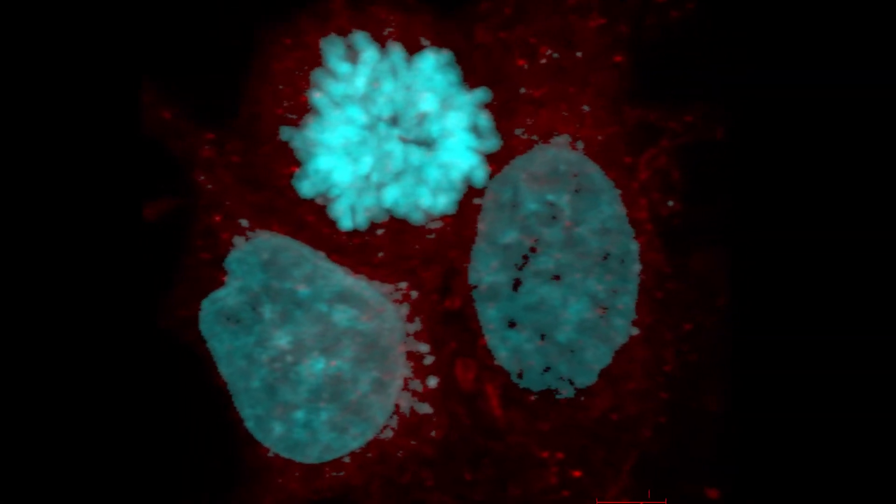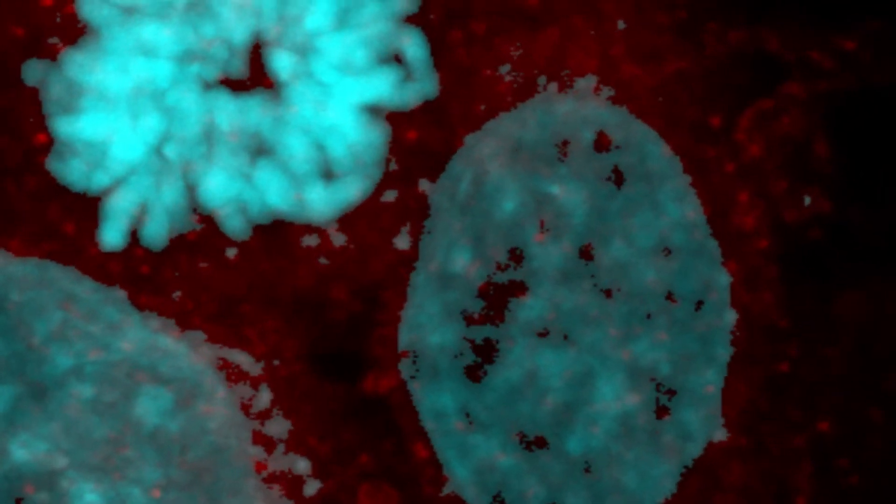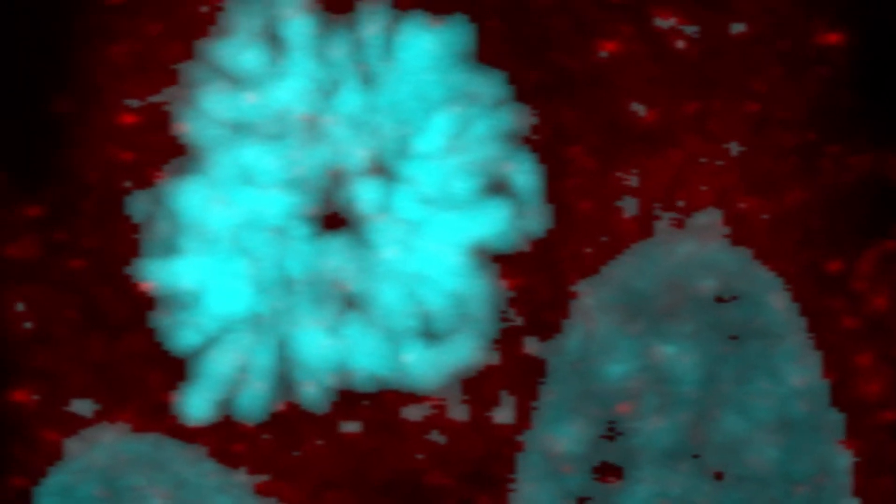The same instruments are used in pharmaceutical labs, for instance for imaging the reaction of a cell to a particular drug. So the skills that students are learning here are directly applicable to the job market.